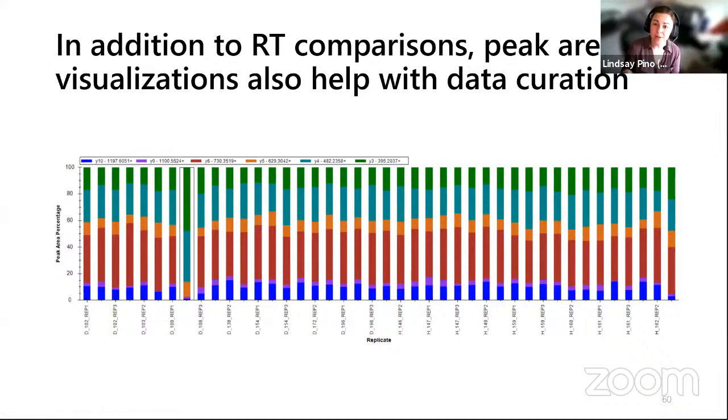This can be very important downstream when we're trying to do things like MSstats, because with MSstats, we're going to be trying to compare the variance between 2 sample groups. If some of the variance in a sample group is due to a mispicked peak, it can make it impossible for us to detect that statistically significant biological variance.